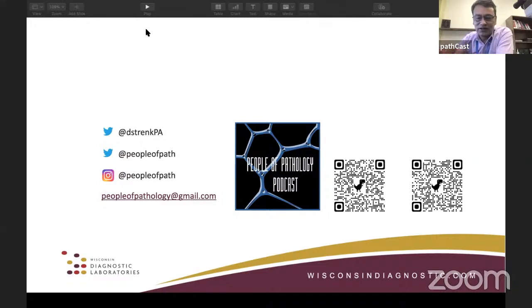the beautiful way to submit two same size lymph nodes is to ink one of them, right? And if you're bisecting it, ink one of them and leave the other. Otherwise, it will be so confusing. The attending pathologist will think that there are 4 lymph nodes if you have not included it in your gross description. So in your description, you definitely should mention how many lymph nodes are there in that cassette. And if you don't know, like there are more small ones, so it's okay. That is not a problem.